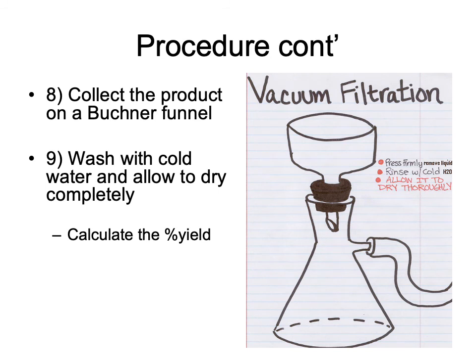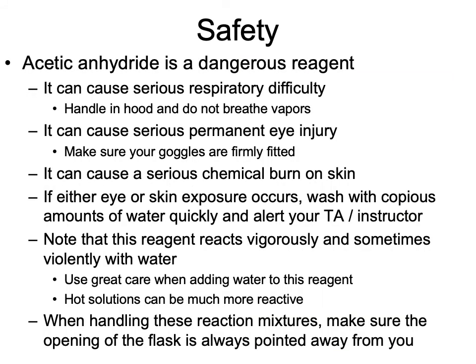And then with the use of vacuum filtration, we are going to obtain all the crystals that already formed. So these are the safety protocols that you need to follow, all of them, and you need to be cautious to do all the safety steps.